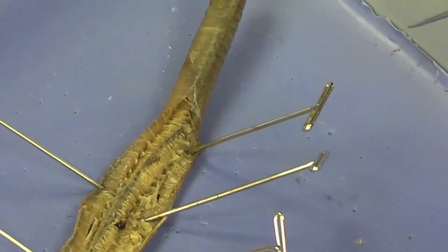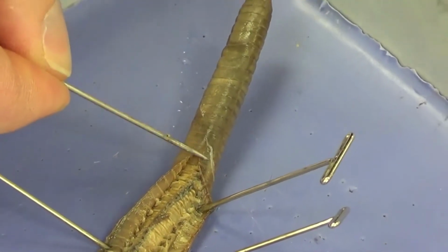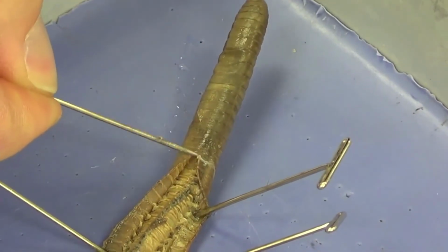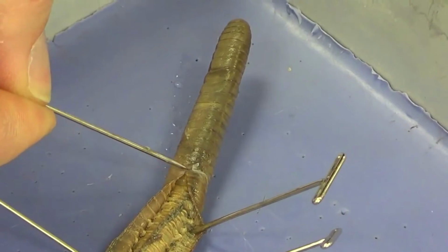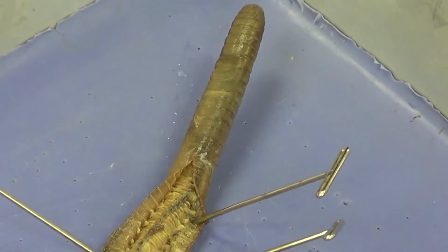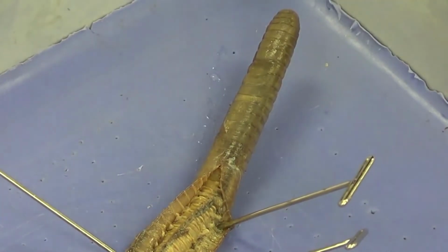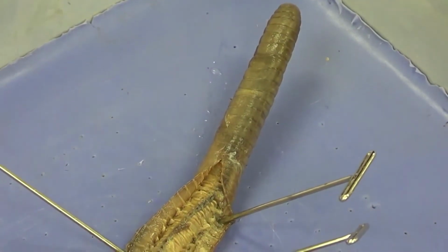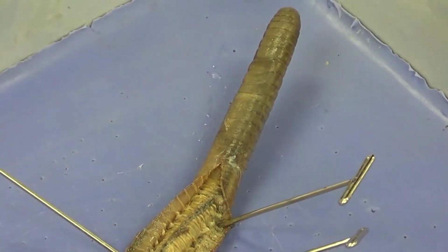Now you can see right here this saran wrap like material beginning to appear. I've got a pin right underneath a little bit of it here. And this saran wrap like material, you can see it right there, is simply the cuticle. And that cuticle is going to be responsible for protecting the earthworm, both in terms of dehydration a little bit and in terms of protecting it against abrasion as it works its way through the soil.